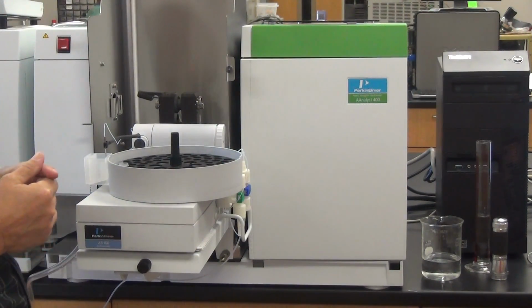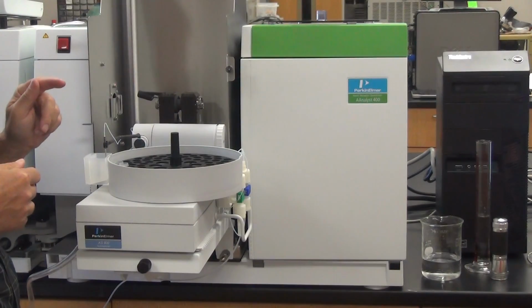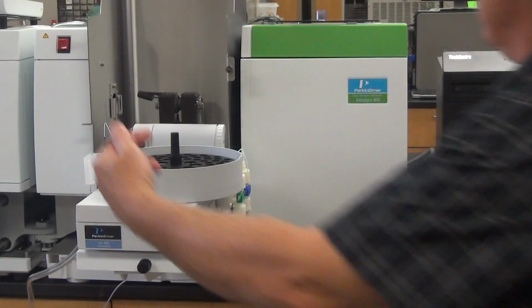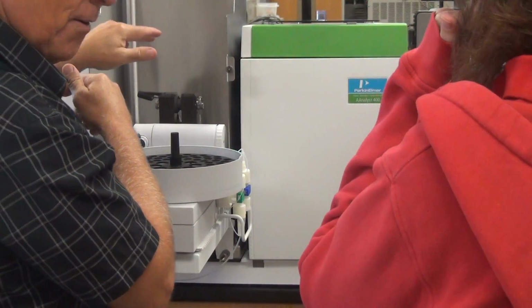Makes life a lot easier, because if you're looking to set the depth here, you're looking into the lamp, and the lamp's modulated. You cannot see this pipette tip. So I don't look this way, I look that way, and I need a piece of white paper with a light shining on it.